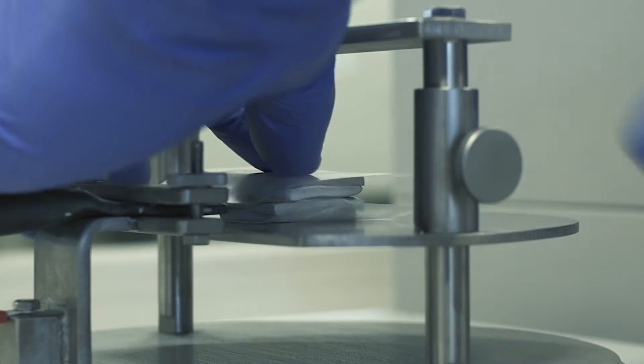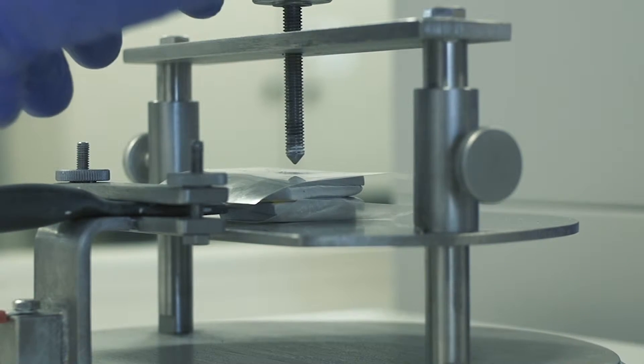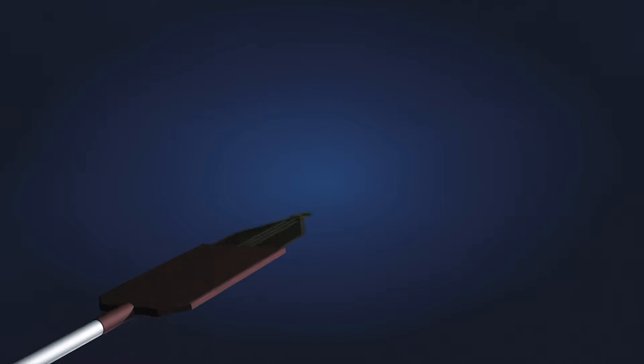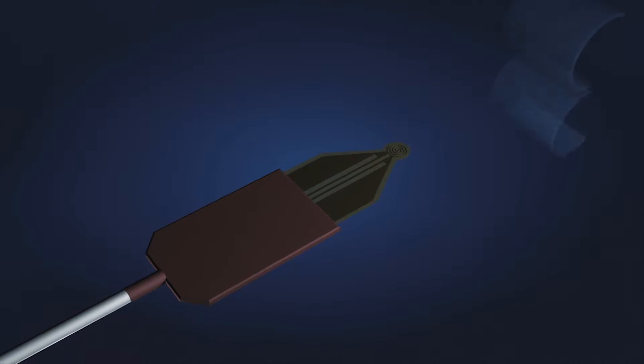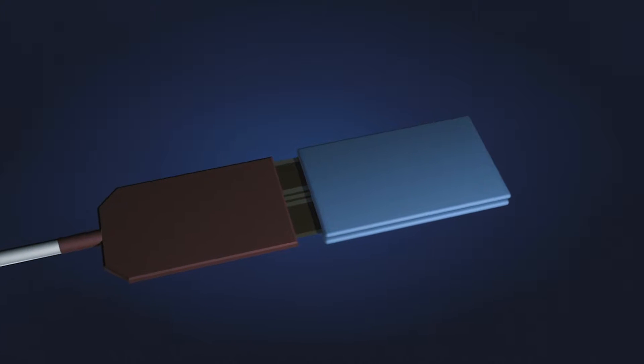The hot disk method uses a thin, disk-shaped probe placed in the center of a small sample of material. A current is run through the probe, causing it to heat up. The same probe then monitors the temperature versus time response of the sample with a very high degree of accuracy.